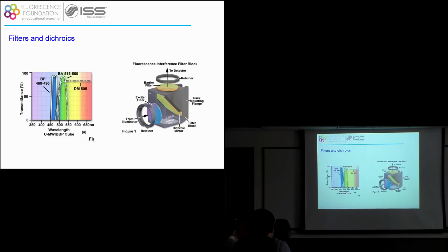In this case, the transmittance starts around 500 nanometers and above. So what it means is that we can use any wavelengths before 500, like in this case it is optimized for fluorescence, so we say excited at 488 nanometers. The light hits the dichroic mirror, is reflected down to the sample, the fluorescence comes up, the fluorescence occurs at longer wavelengths, is transmitted through the dichroic mirror, and it finishes up in the detector.